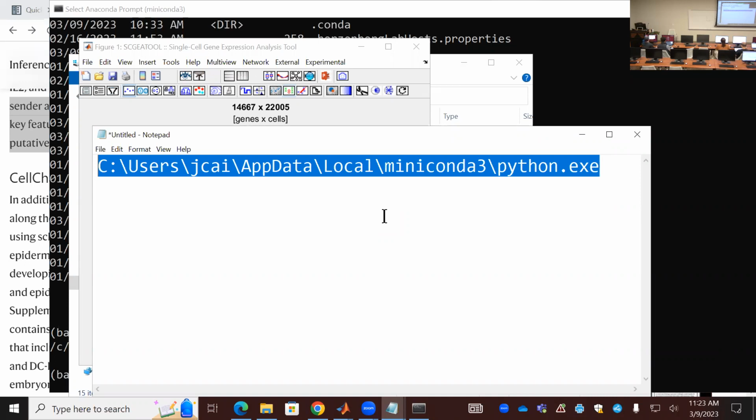You should type the whole thing in here. Yeah, okay, .exe. Oh, yeah, I can. Okay. Not valid. Oh, I think this is just backslash instead of slash. Oh, okay. Yeah, then you should be okay.